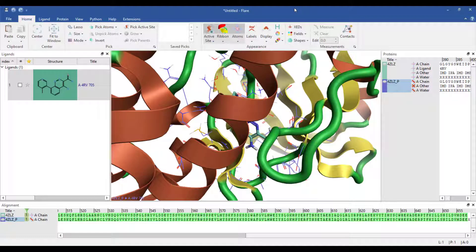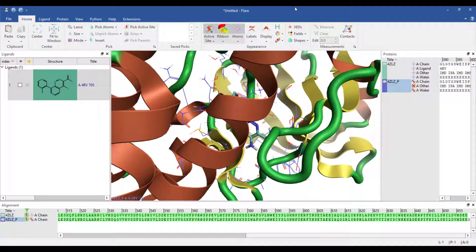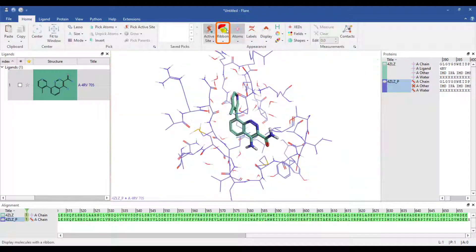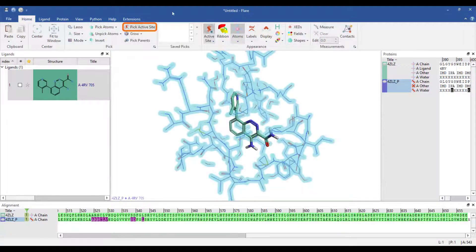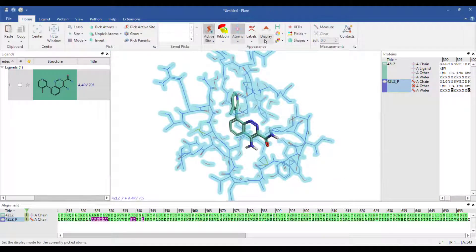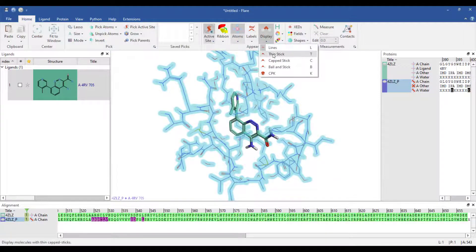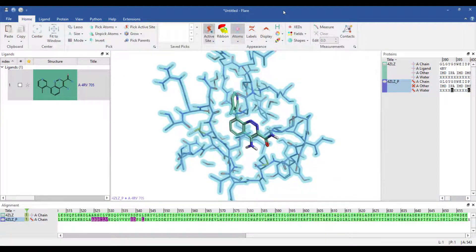The display of proteins, ligands and other objects in FLIR is highly configurable and enables you to create attractive displays which can be saved out as high quality images. I will first turn off the ribbon and change the display style of the protein active site residues to thin stick.